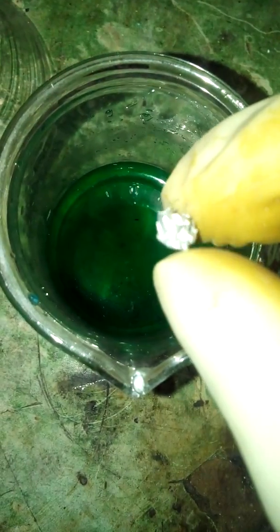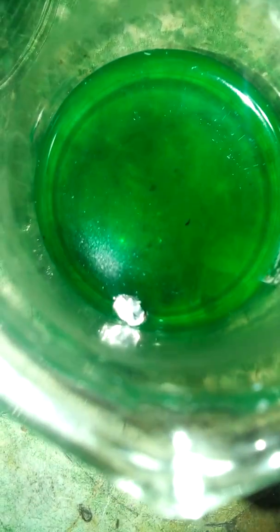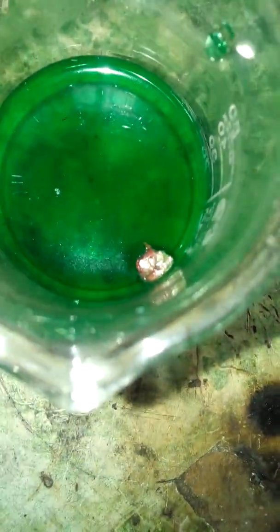We're gonna add a bit more water and mix it up. Now I think I've dissolved most of the salts. I'm going to drop in an aluminum ball — it starts a bit slow but as you can see it is reacting.